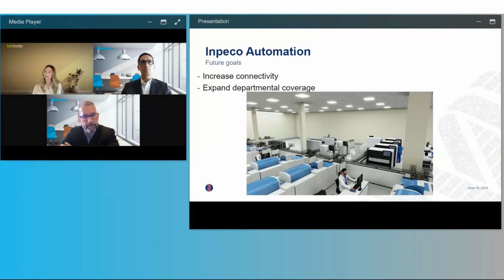Just from the perspective of the user, there are two major things that you've got to think about. One is the physical piece of it. The other is the software piece of it. We talked a little bit about the physical piece of it earlier. In an operating laboratory, you're going to impact that laboratory as you move instruments around, as you connect them to the track, as you have to have space to build the track, the HVSs, and so forth.